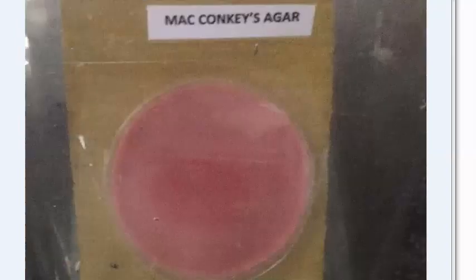Moving to differential media: CLED agar — cysteine lactose electrolyte deficient agar — is non-inhibitory and used for isolation and differentiation of urinary organisms. It is electrolyte deficient to prevent swarming of Proteus species. Lactose fermenters can be identified using the bromothymol blue indicator.